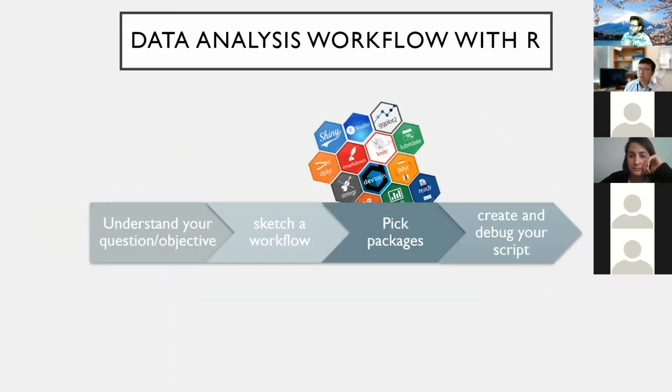So understanding which packages to pick is also important. Not always, oh, and I should mention, we're going to be using this for qPCR analysis today.